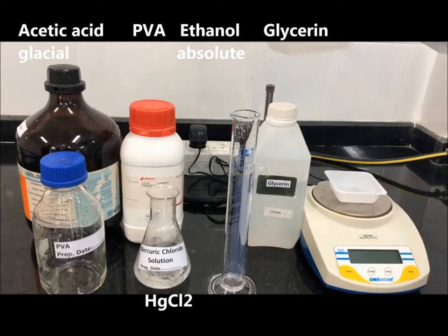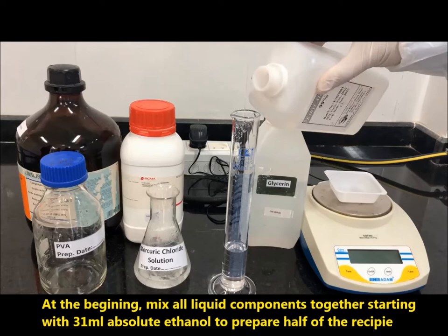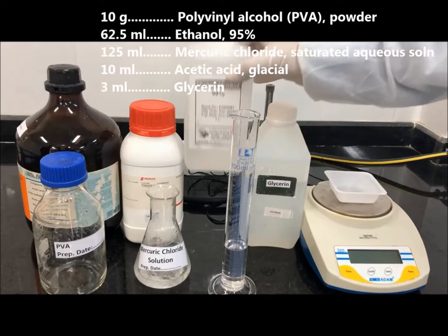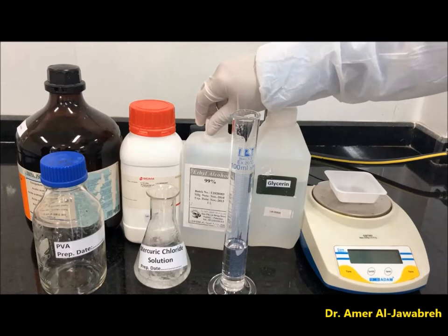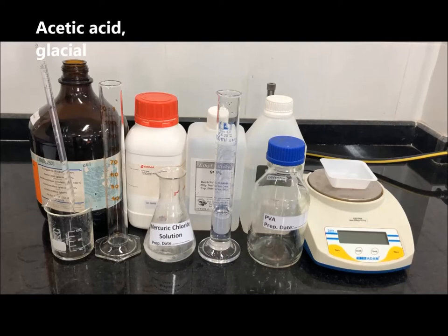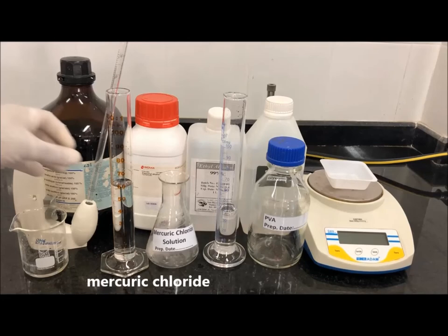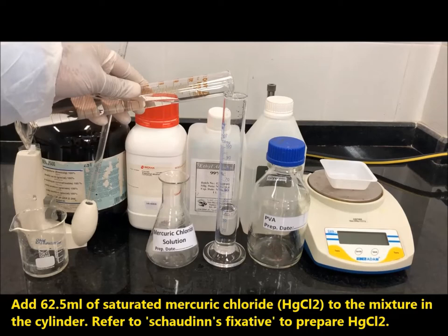At the beginning, mix all liquid components together starting with 31 ml absolute ethanol to prepare half of the recipe. Add 5 ml of glacial acetic acid to the 31 ml ethanol in the graduated cylinder. Then add 62.5 ml of saturated mercury chloride, HgCl2, to the mixture in the cylinder. Refer to Chauden's fixative video to prepare HgCl2.